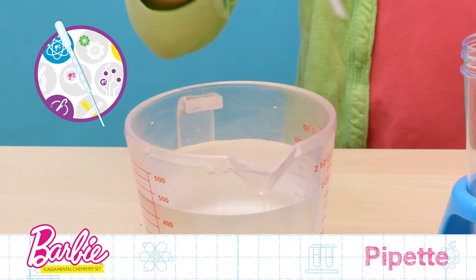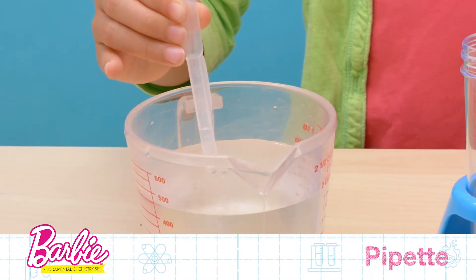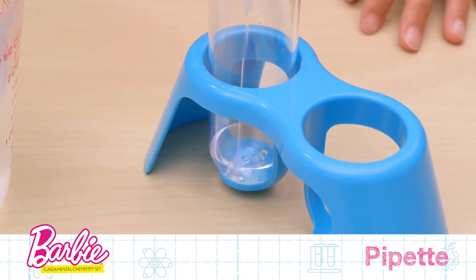Next is the pipette. Pipettes, or droppers, are used to carefully measure liquids and drip them into other containers.